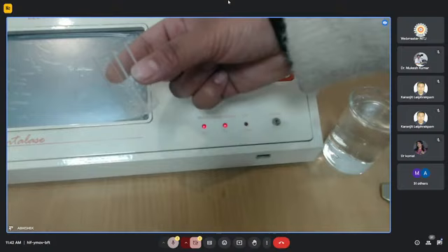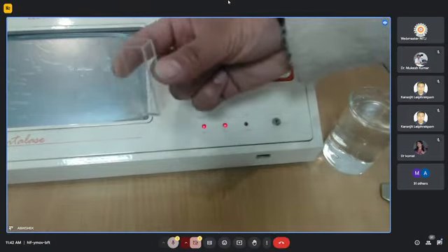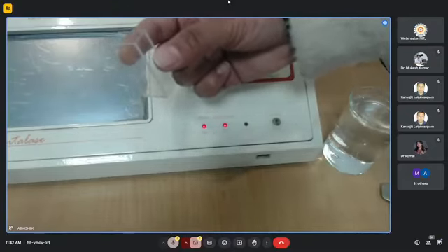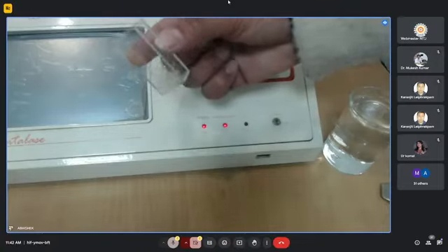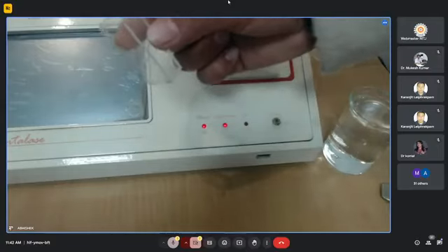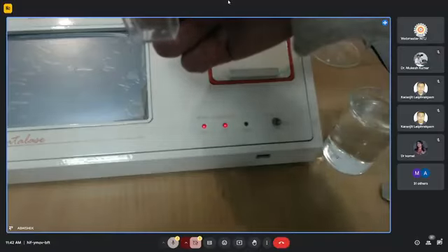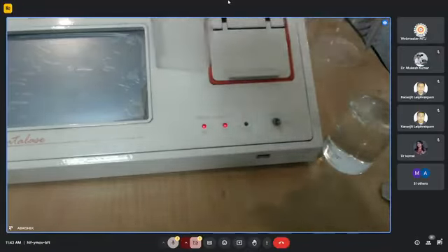The cuvette is a component made of ultra pure silica, and it should be handled very carefully. Any dust particle on the surface, any fingerprint on the walls, any scratch on the surface, or any deposition of material on this cuvette can affect the precision of the instrument. The cuvette should also be held from the edges and from the top, not by the side walls.